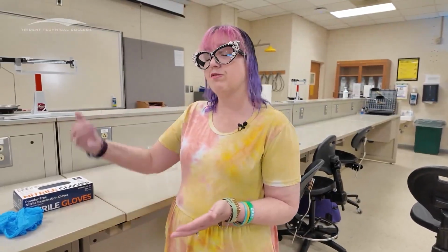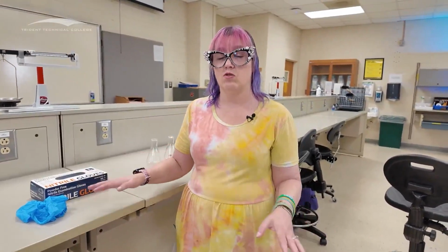I'm then going to wash my hands to make sure that I get anything off of my hands that shouldn't be there, because sometimes we accidentally get chemicals inside. Okay, and then I'm going to go do whatever I need to do. When I come back to the lab, I'm going to go to the front bench. I'm going to wash my hands again, just because I'm paranoid. And then I'm going to put on another pair of gloves. I'll do that before I handle anything in the normal part of the lab, because chemicals can be just about anywhere. So we want to make sure that we're dealing with clean hands before we put them back into those gloves.